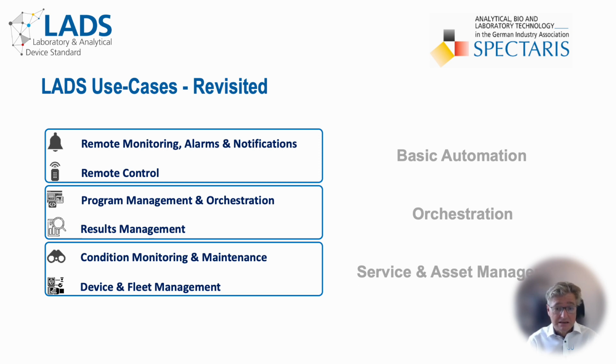This is a solid starting point for robot integration, but there's a crucial missing piece: the spatial locations. Robots need precise spatial information to approach and interact with the instruments effectively. This includes the position of instruments on the bench, the location where the samples can be placed into the instruments, and so on.